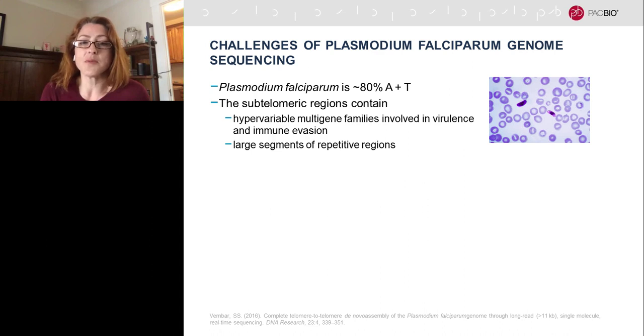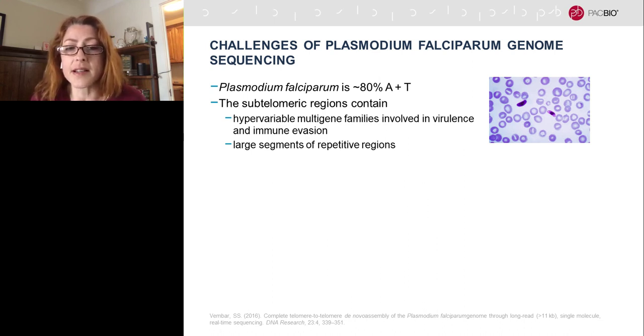The Plasmodium genome is organized into 14 different chromosomes at a range of sizes. The first genome assembly for Plasmodium was reported in 2002 using shotgun sequencing methods. And then there were additional attempts with every ensuing technology to improve or add to the number of Plasmodium genomes.